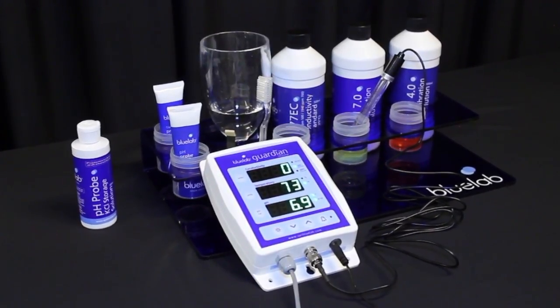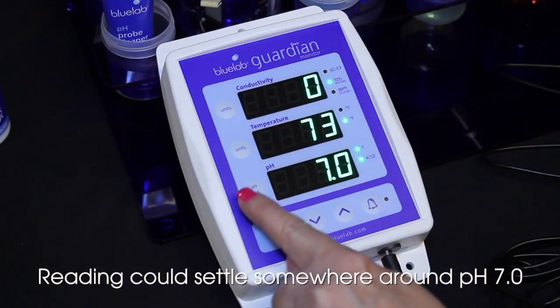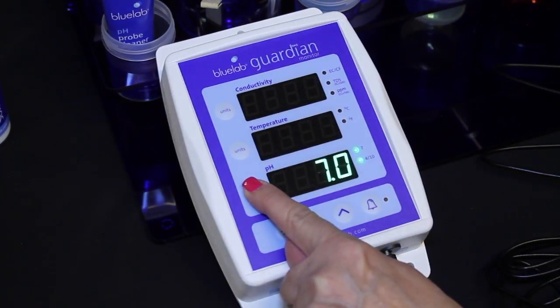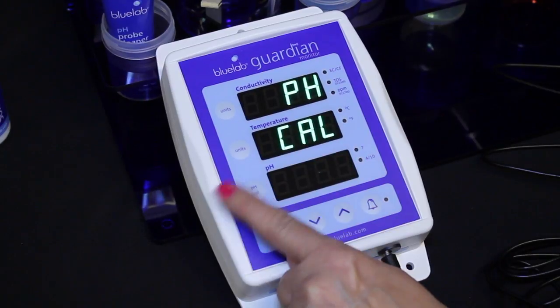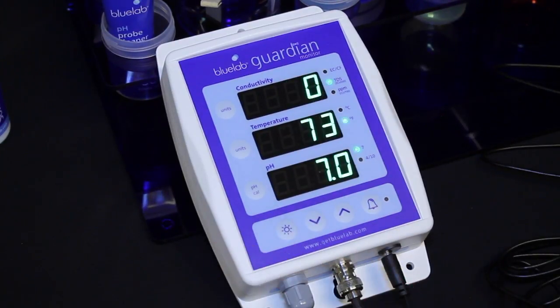Place the pH probe in pH 7.0 solution. Be sure to wait until the reading has stopped moving. Press and hold the pH cal button until the monitor shows pH and cal on the top two displays, then release the button. 7 will flash on the pH display, then the pH 7.0 indicator light will glow.